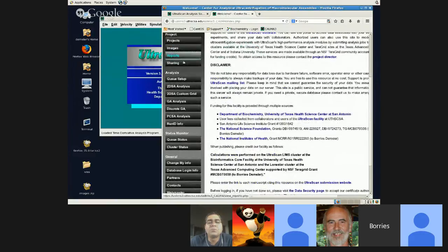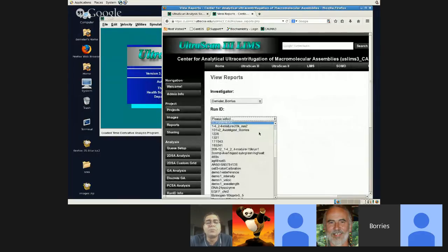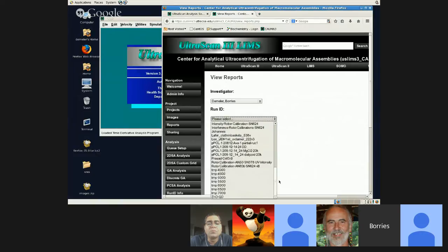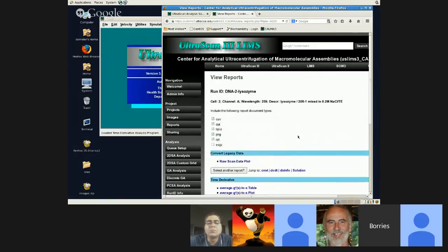So I go to the reports, and then the lysozyme 2 is alphabetically ordered, I think. Let's see, where is it? DNA 2 lysozyme, that's where it is. And then you get a link for it, and when you click on it, it loads up the report.